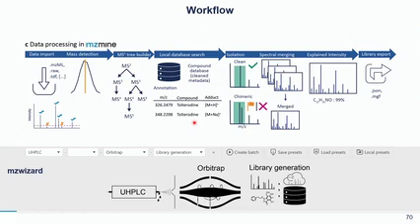So was it clean? This you can see as a chimeric one. Was there anything very high abundant in the isolation window of the precursor, for example? And then this information is also exported with the library itself. So later on you can still see what the setting was, or what the purity was in this spectrum, for example, that was just exported.